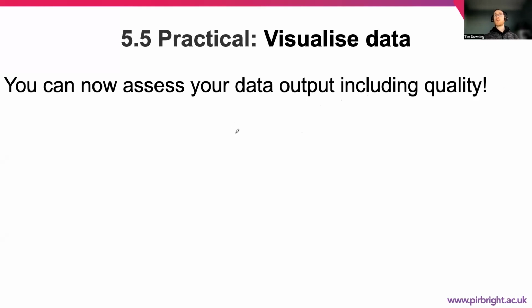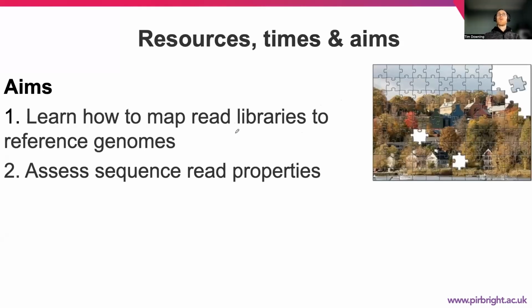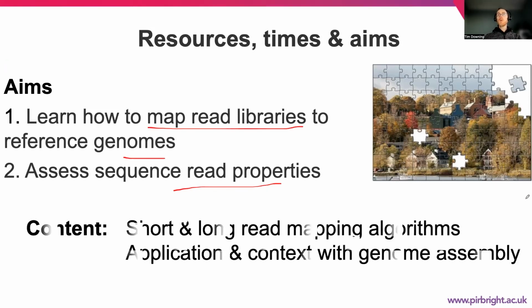So that concludes our demonstration video on this lab. We've looked at the ideas about how to map different types of read libraries to reference genomes and assess the output that we get from them, to get a better sense of the picture of what we're looking at. We looked at how we can do that with short and long read data and how we can link them together with genome assembly.